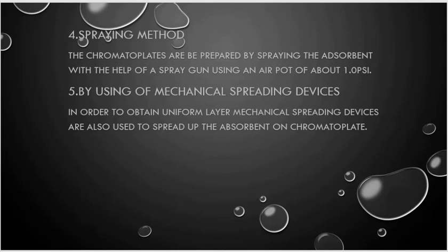Clear? Then we have another method using mechanical spreading devices. In order to obtain a uniform layer, mechanical spreading devices are also used to spread the adsorbent on the chromatoplate, but the most used method among these is the dipping method.